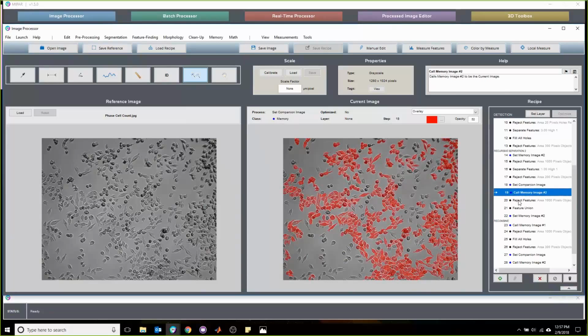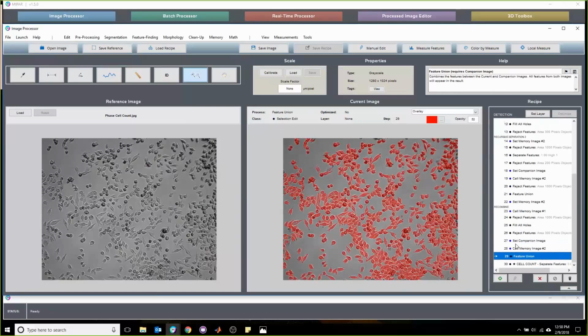So what we're able to do is call back our pre-separated image, reject the clumps from before, and reunite the separated layer. And then the very last thing we do is recombine the cells that we removed in the very beginning. I'm going to go through this very quickly. And as we can see, I apply a very last separation.